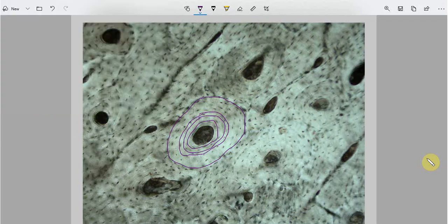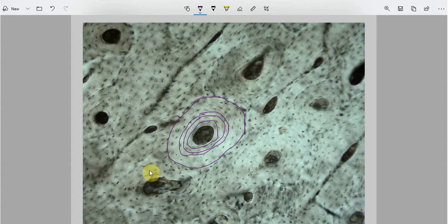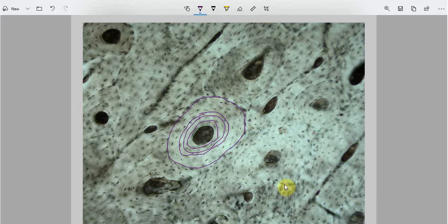These lamellae form the bulk of the compact bone — that is, the majority of compact bone is formed by these concentric lamellae. Here, one concentric lamella, another concentric lamella, and so on. These lamellae form the basic metabolic unit of bone, known as the osteon.